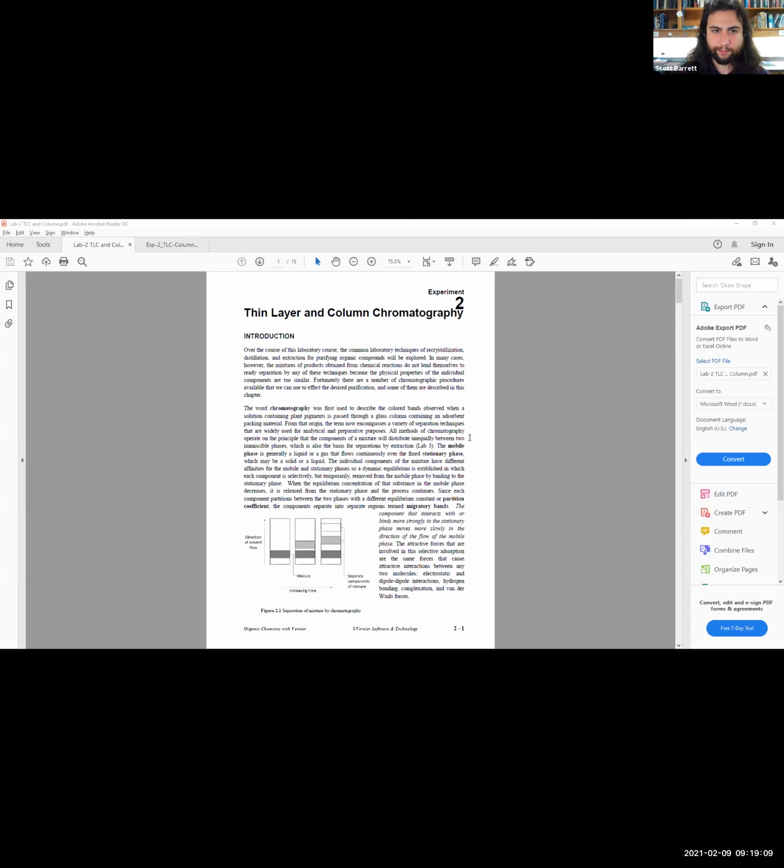Maybe it's pretty simple. Effectively, these two go hand in hand together: TLC, thin layer chromatography, and column chromatography. TLC is the method that we test chemicals in order to check how polar or non-polar they are, and that is in turn how you can see the RF value of when a molecule moves up, if it's more non-polar, moving with your mobile phase, or if it's more polar and staying with your stationary phase with regards to the silica plate.